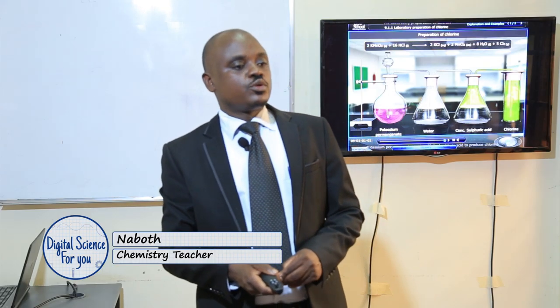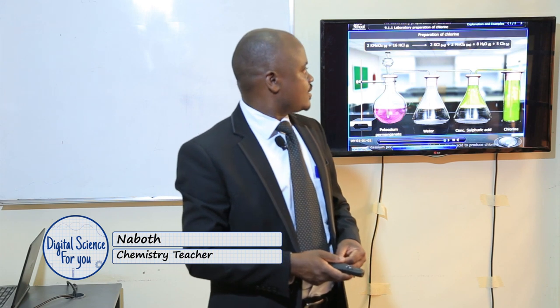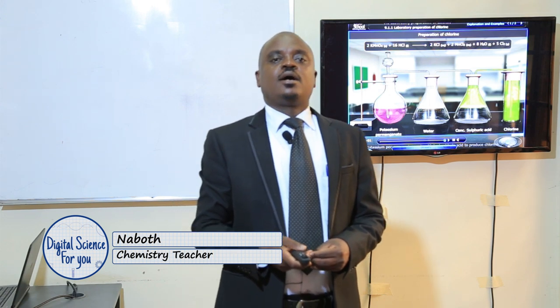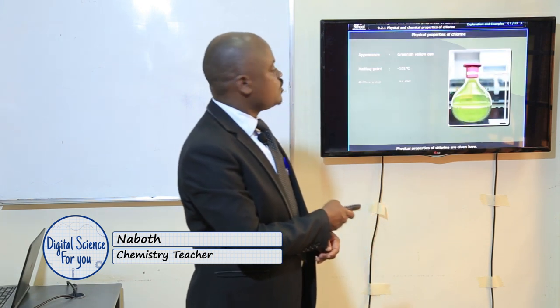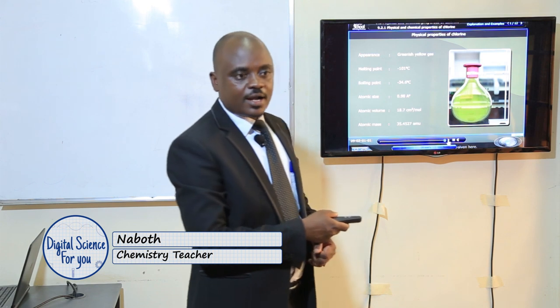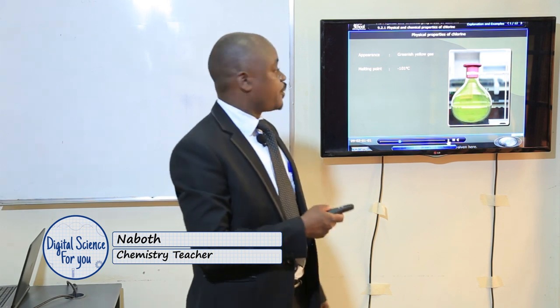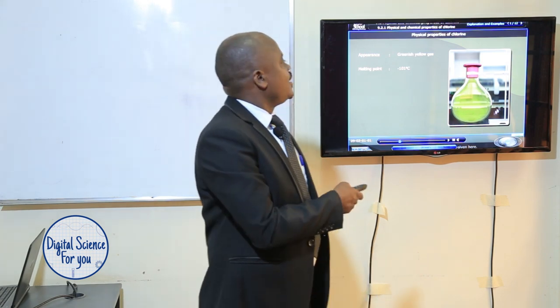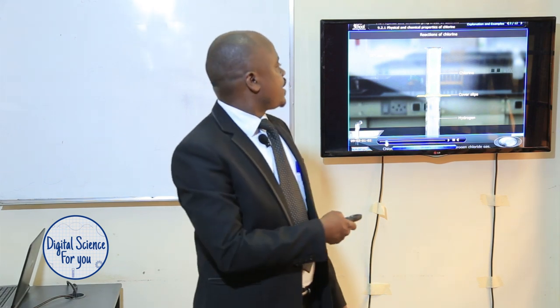Having looked at this, we now need to emphasize and look at the properties of chlorine gas. Remember, all the gases that have been prepared in your class have been colorless. But today we see that chlorine is not colorless — it is a green-yellow gas. Wonderful. You cannot see this in school since we don't prepare the gas, but Digital Science can show you the gas. Isn't it wonderful? So after looking at the physical properties of chlorine gas, let's look at its chemical properties.